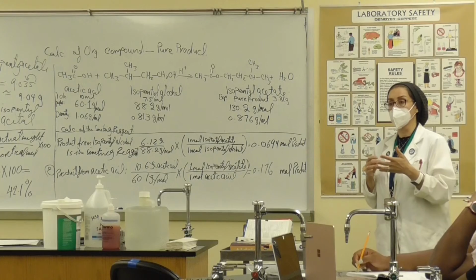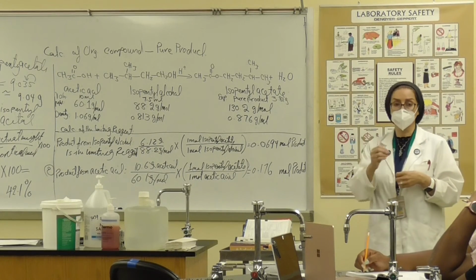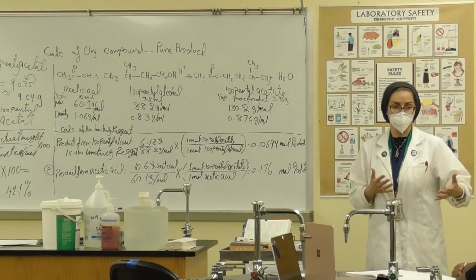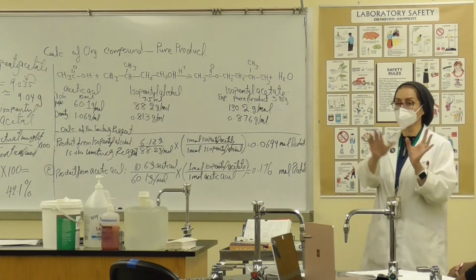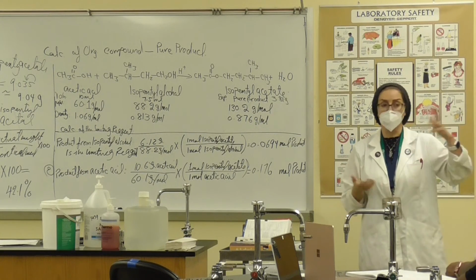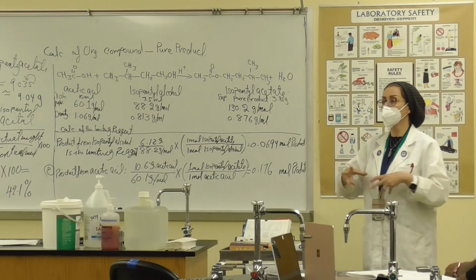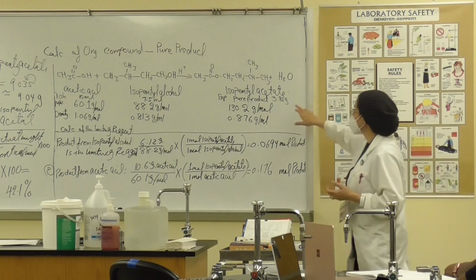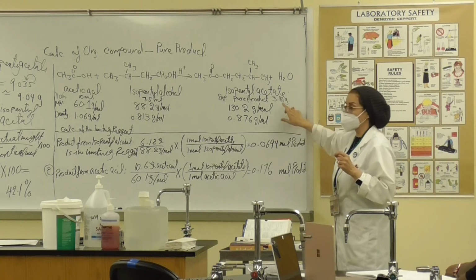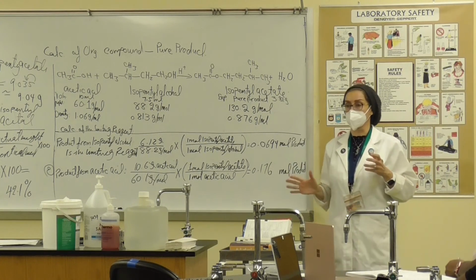And we want to find out how sufficient or efficient our own practical is. Because as I told you, some of you probably will be able to find a percentage of over 50. Some of you will find less, and it depends on how much you are going to recover. Because this recovery is very, very important.